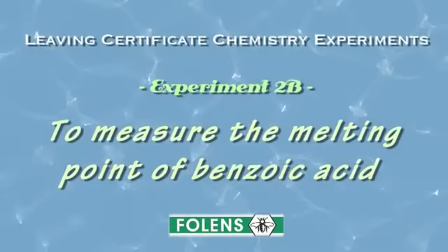We had to leave the crystals to air dry overnight, as an incorrect result would be obtained for the melting point. Measuring the melting point of a substance is often used by chemists to test the purity of a substance and also to help identify the substance. Tables of melting points of most common substances are readily available to help in this task.